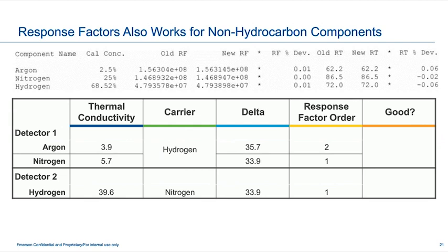And there's a reason for that, and a reason why we've broken out the comparison, only comparing argon to nitrogen and then hydrogen by itself. When you're comparing response factors, a critical thing that sometimes gets glossed over is that you need to have the same sample loop, the same flow path, and the same detector. That is why hydrogen and nitrogen aren't compared to each other, and why their response factors vary. The flow path is different, they're using different valves, a different carrier, and a different thermistor.